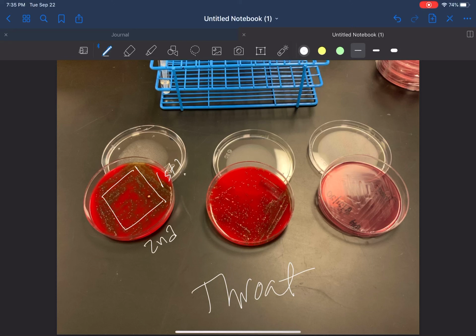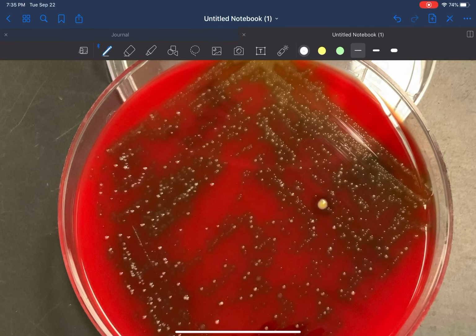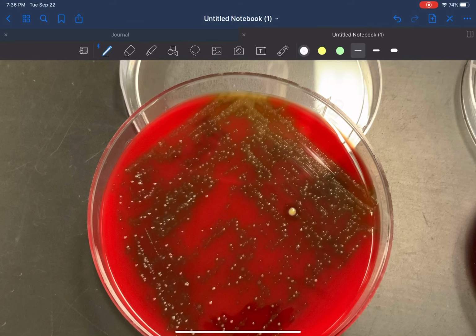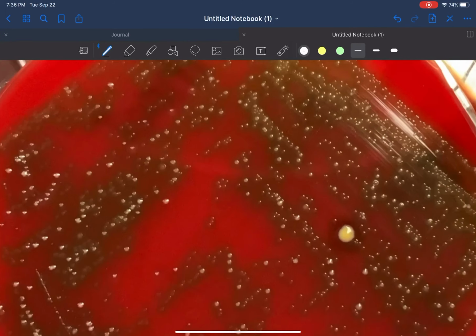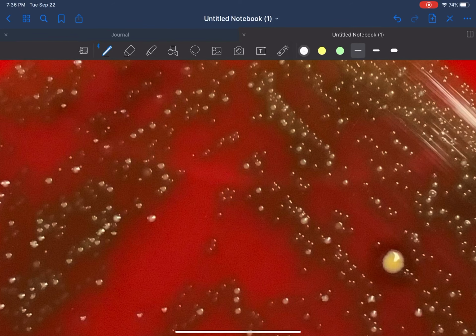And we did get isolated colonies. I think this was the blood agar plate, this was the CNA, and this was the MacConkey, with no growth. So let's look individually. There is some isolation, but it would be really hard to do a workup on anything that looks suspicious, because we need to see how many different colonies we have.